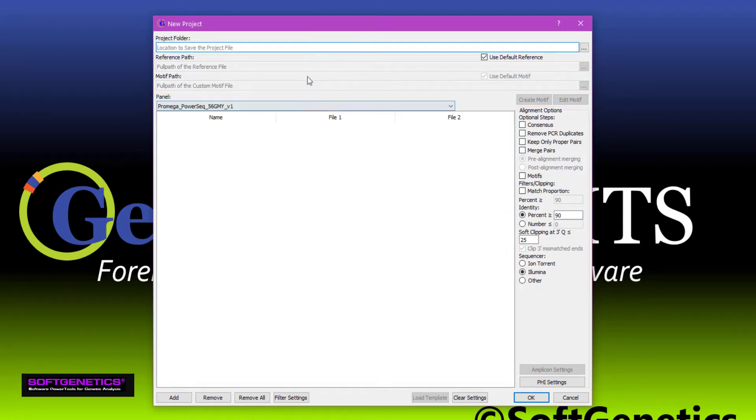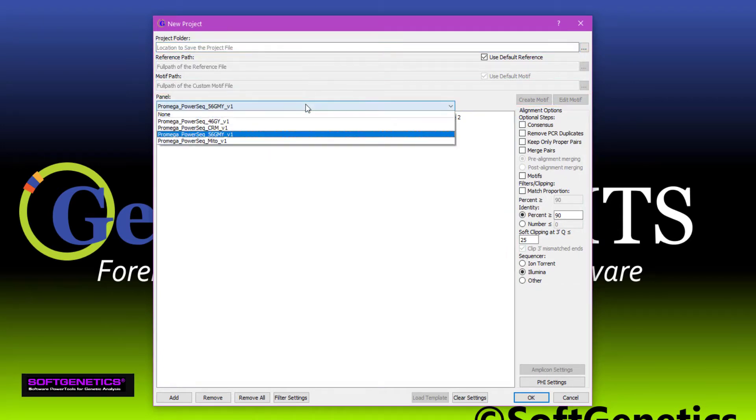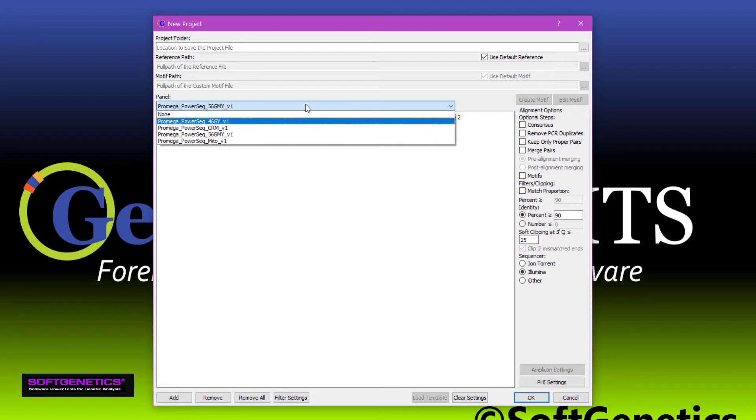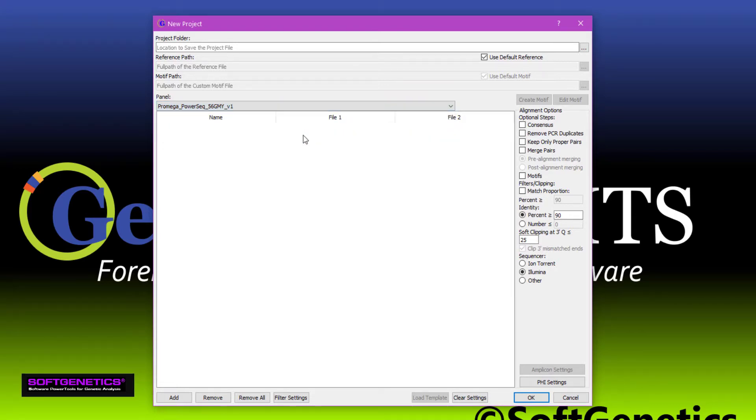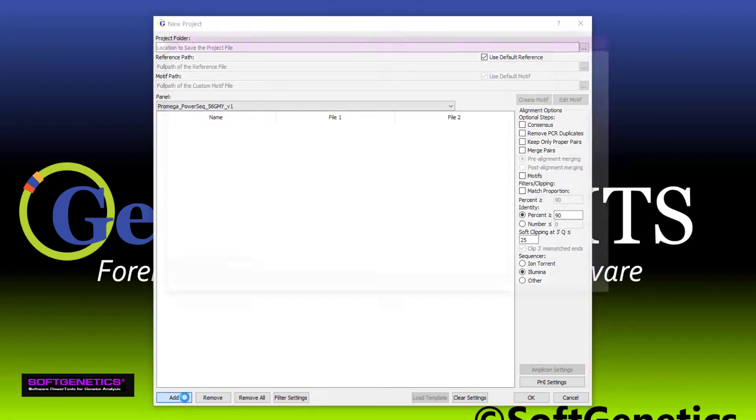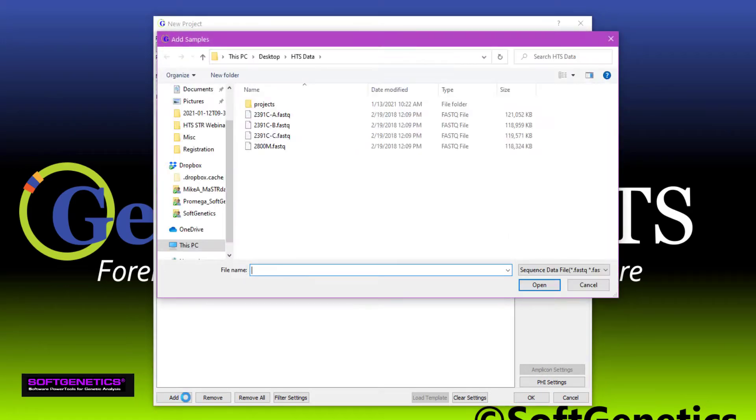If you are using one of Promega's PowerSeq kits, you can choose to use the corresponding panel. Otherwise, we can help you develop a custom panel for the chemistry you are using. Today, we'll be looking at STRs, YSTRs, and MITO data that was generated using the Promega PowerSeq 56-GMY kit. I'll just press Add to bring in the data and navigate to the necessary files.